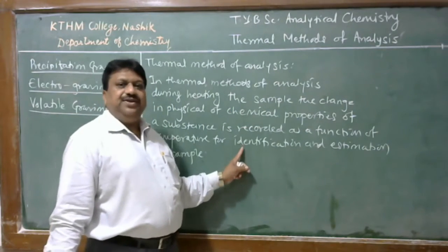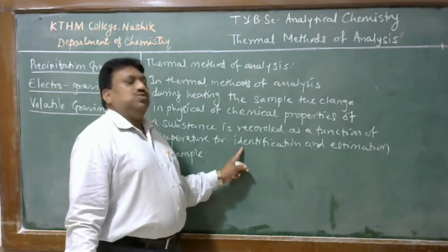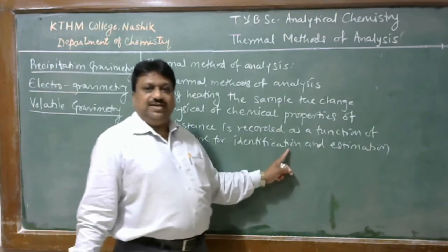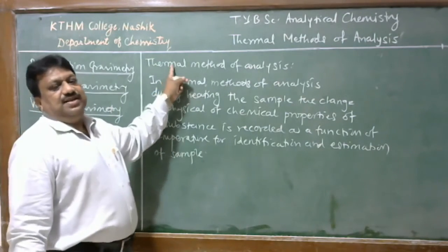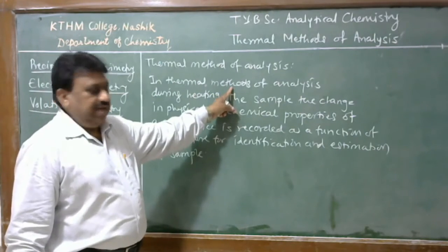That means we can carry out qualitative analysis of that substance as well as determine the amount of substance. Therefore, in thermal methods of analysis, both qualitative as well as quantitative analysis is carried out.